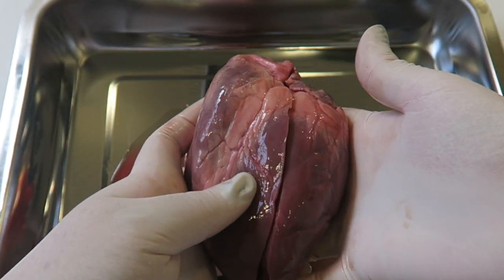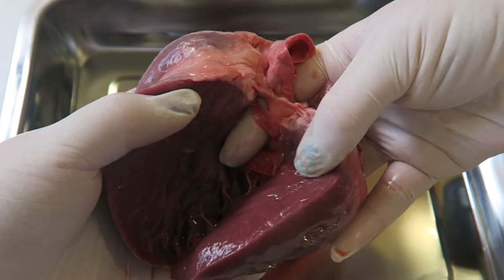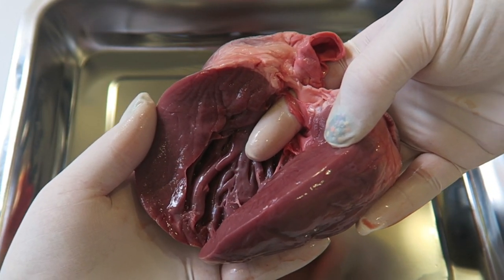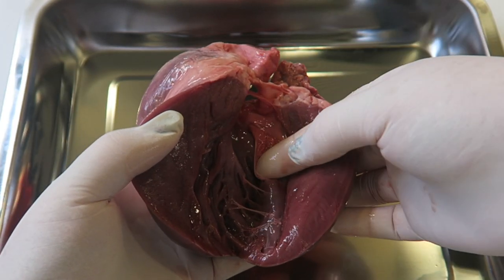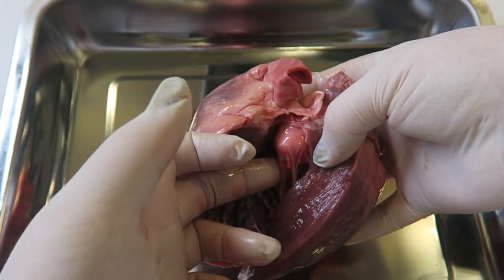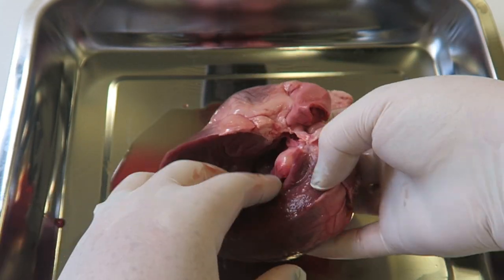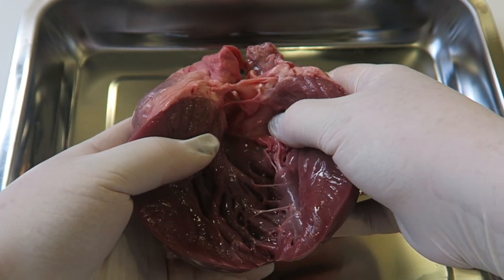So if we just put that back together quickly, you can see that this one here, if I put my finger down there, is going to come out in the left ventricle down the bottom here. Now these bits here, these are the tendons holding the valve in place. This is the valve here. You can see it's quite thin, but it's very, very strong. So if I just wiggle my finger around, the only place I'm holding the heart up is on that valve there. It's a very, very strong valve, even though it's very, very thin.